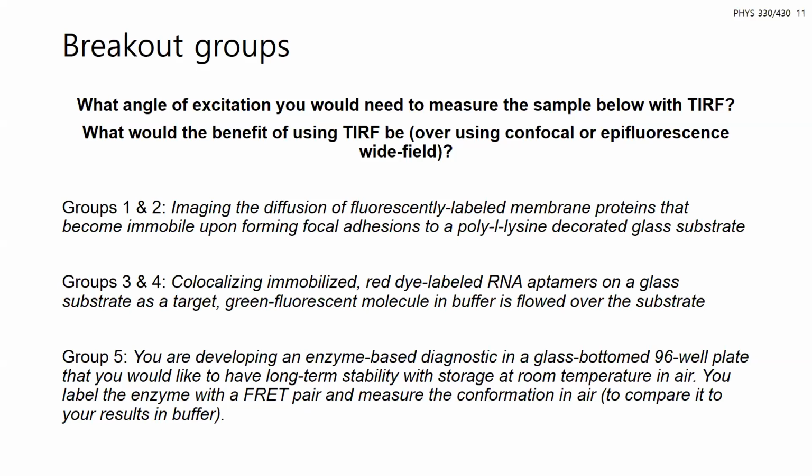So for the angle, we got 40.8 degrees using the refractive index of air, which we just assumed to be 1.00, and glass. I did a quick Google search, and I think Thomas Scientific or some website said that their 96 well plate had a refractive index comparable to glass, so we just used 1.53, and then we got the angle of 40.8 degrees.